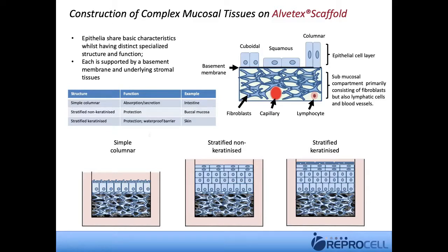That's really important to remember, because structure is related to function. What we spend a lot of time doing is ensuring that the structures that we produce in vitro align as closely as possible to what we see in the real tissue in vivo. So we compare side by side continually. I shall show you some evidence of this.